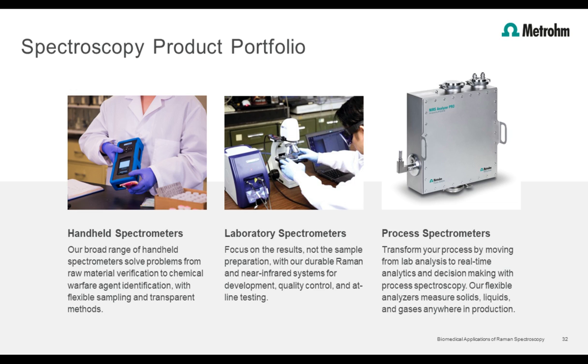We also have laboratory spectrometers, which are the perfect flexible tools for doing these investigative studies. And again, you could eventually scale them up into a device.